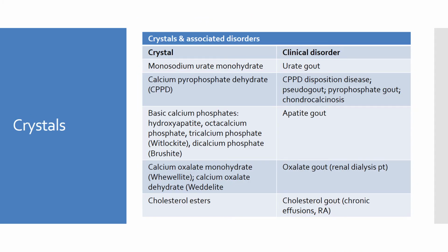What is different about synovial fluid is that frequently we have diseases where we have crystals associated with them. We have crystal-associated synovial fluid buildup. When we see crystals in the specimen, the gold standard for identifying them is to use polarized light, which, as you know, uses special wavelength compensators that allow us to rotate light sources from one direction or the other from the specimen.